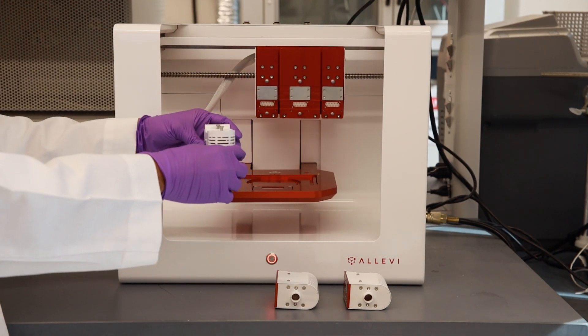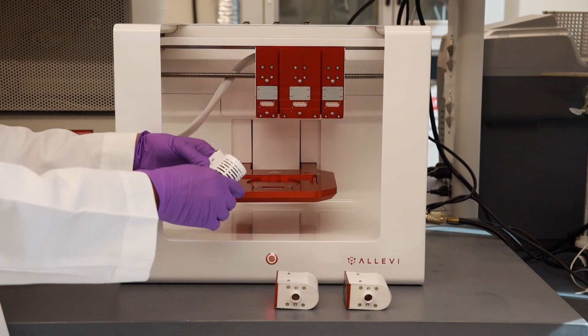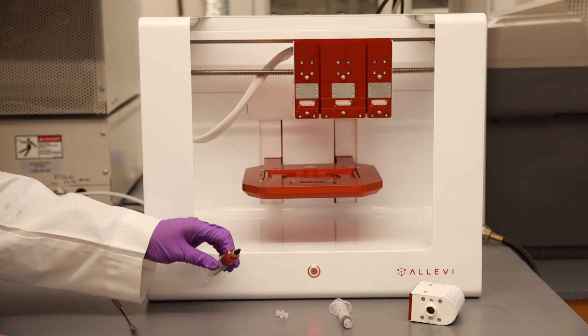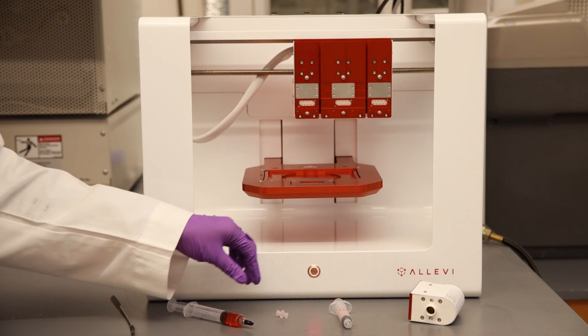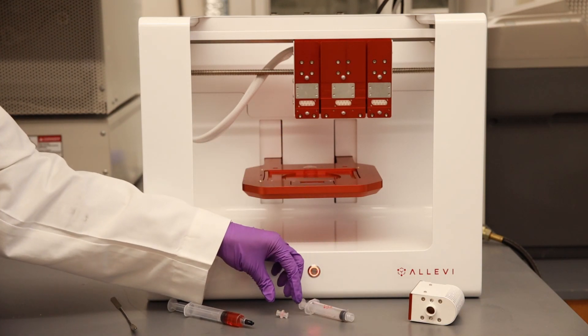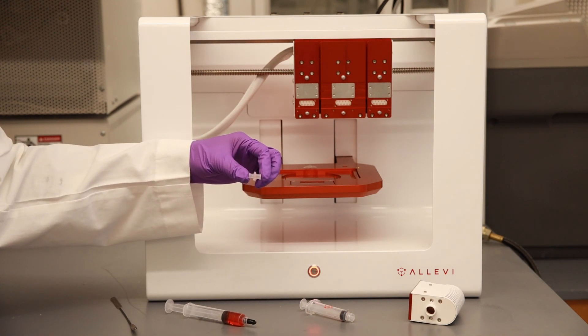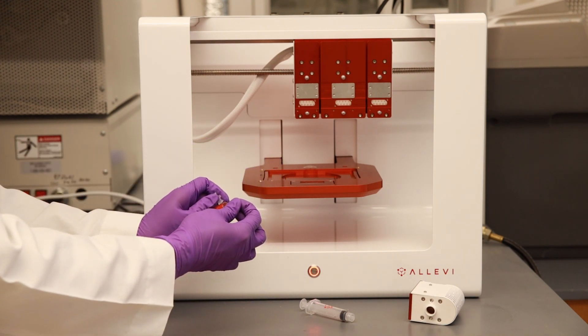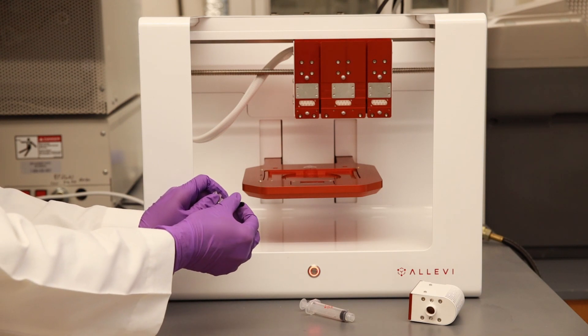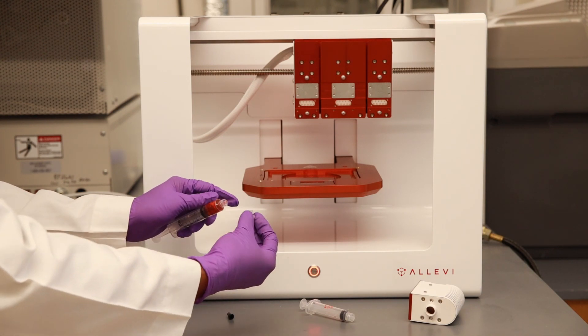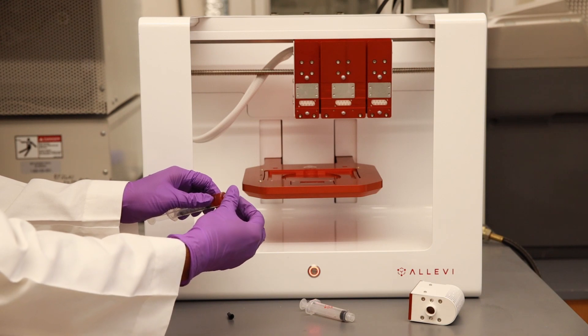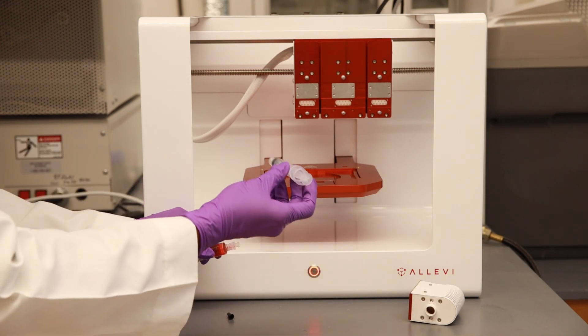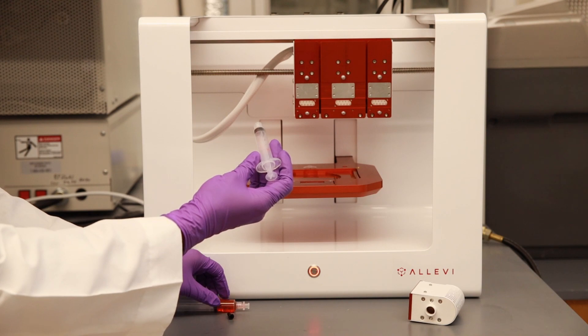The air compressor can provide a pressure up to 120 psi. To transfer the bio ink into Alevi syringe, we will be using a female to female luer lock adapter. Remove the cover of the syringe containing the bio ink and attach the adapter. On the other side of the adapter, we will attach the Alevi syringe.